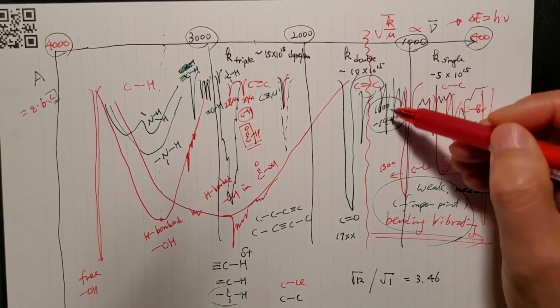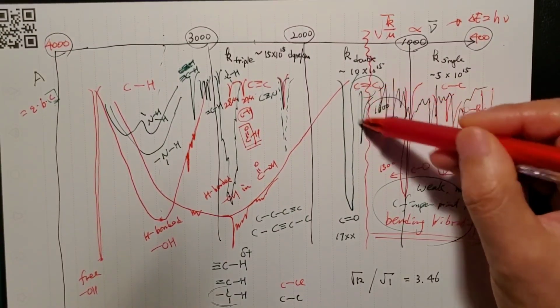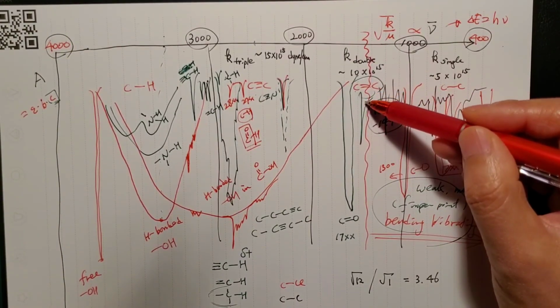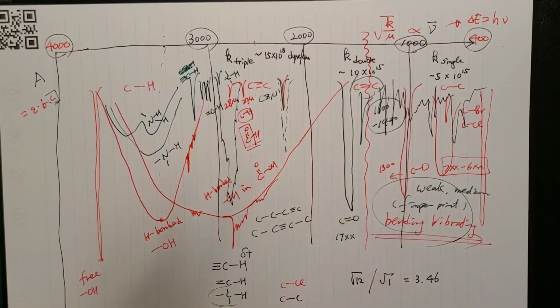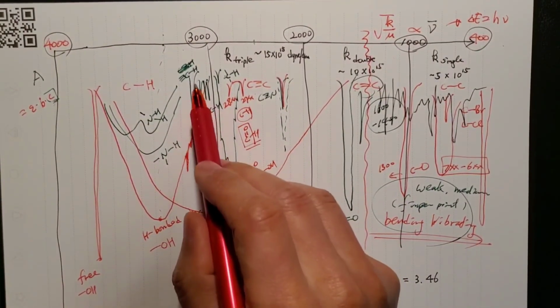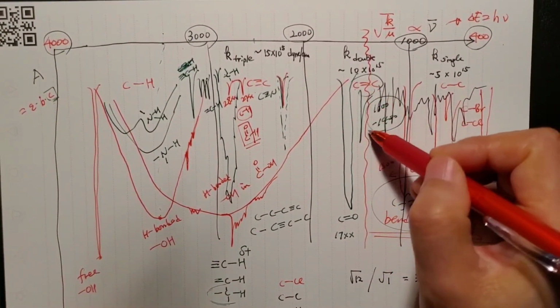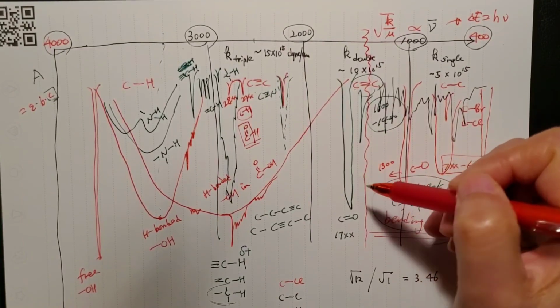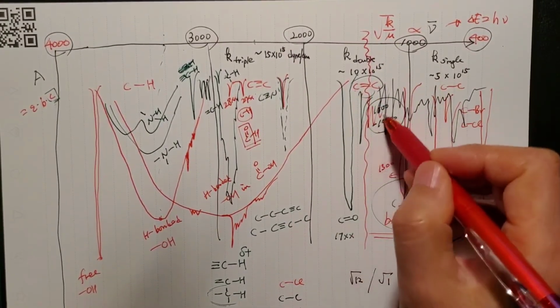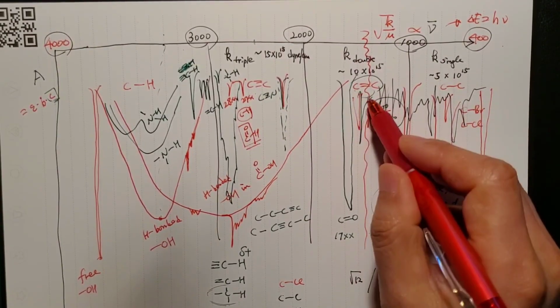The last one, the carbon double bond, shows a signal around here. I said it's not trustable, but you can do it in conjunction with this signal here. But sometimes you see a lot of, several spikes here, and then you also see medium to little taller peaks, more than one, more to the 1600 side, like here, a couple of them.